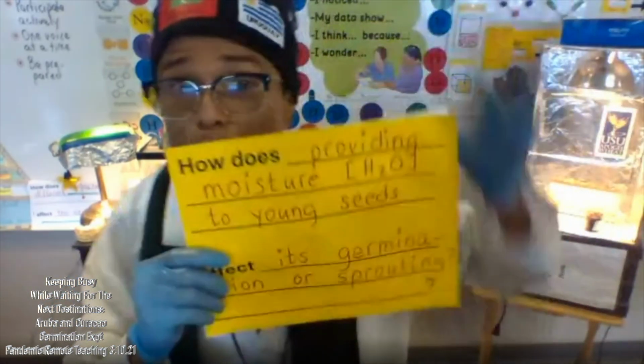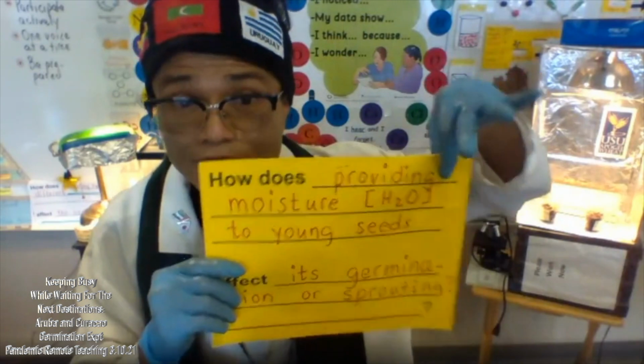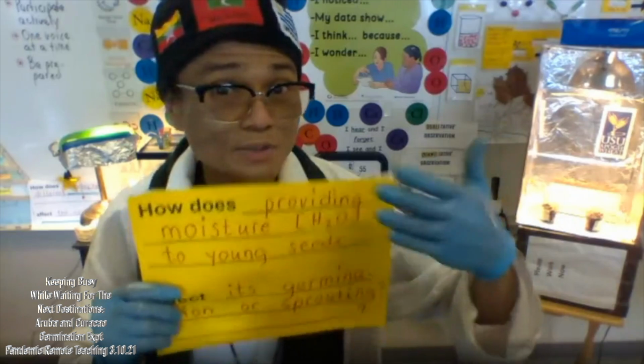All right. Have we accomplished our goal today? Looking at the steps, have we? Yes, we did, right? The step, but we will still be monitoring, looking for evidence on how adding moisture will affect the germination of the seed. All right, that will be the ultimate goal.